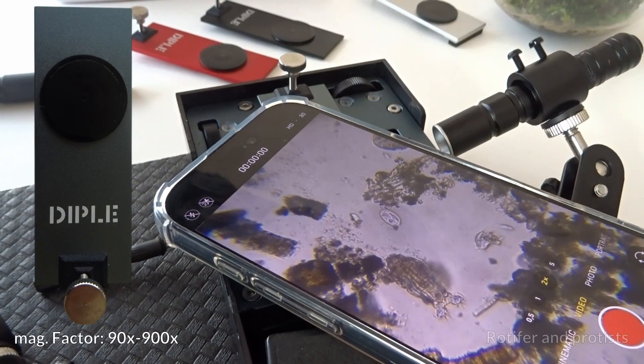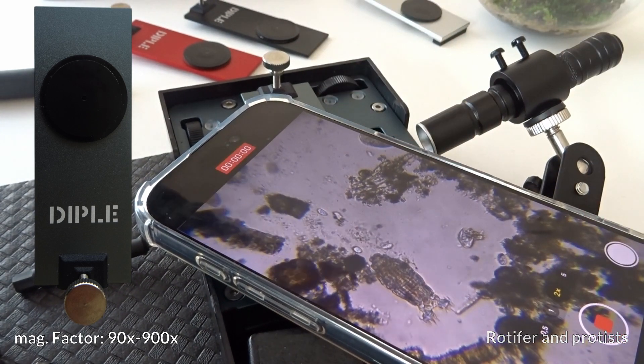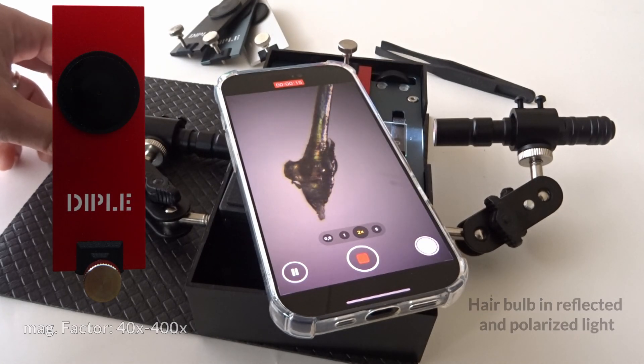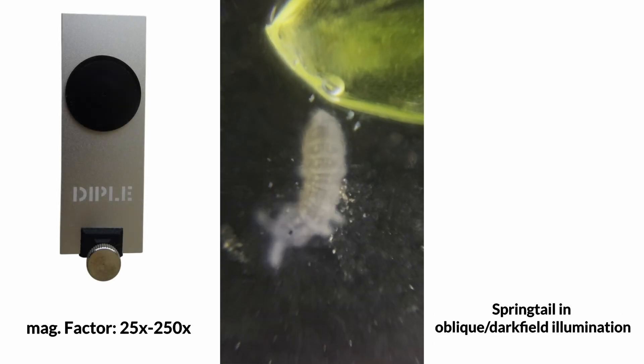Gray lens: with optical resolution lower than 1 micrometer, it's suitable to see cells and microstructures with an amazing level of detail. Red lens: the ideal lens for bright field and oblique illumination microscopy. Silver lens: the best lens for reflected light microscopy, to use on or down the stage.